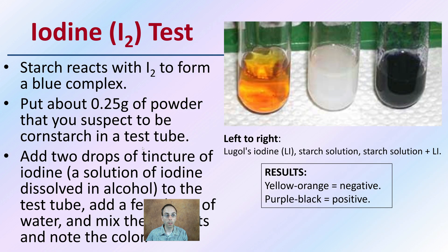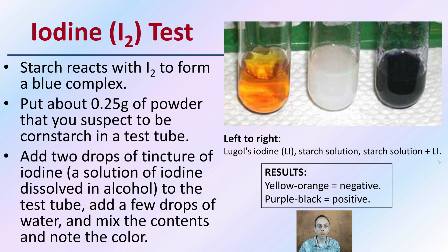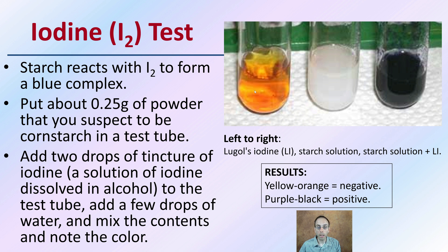We have the iodine test. Starches react with iodine to form a blue complex. Add about a quarter gram of the powder suspected to be cornstarch to a test tube, then add two drops of a tincture of iodine — a solution of iodine dissolved in alcohol — plus a few drops of water. Mix and note the color: a yellow-orange result is negative, while a purple-black result is a positive test.